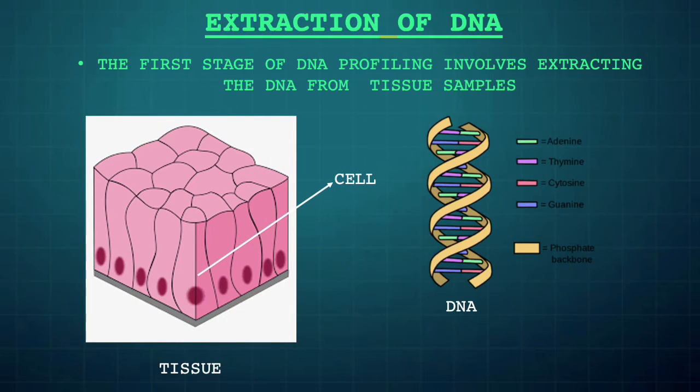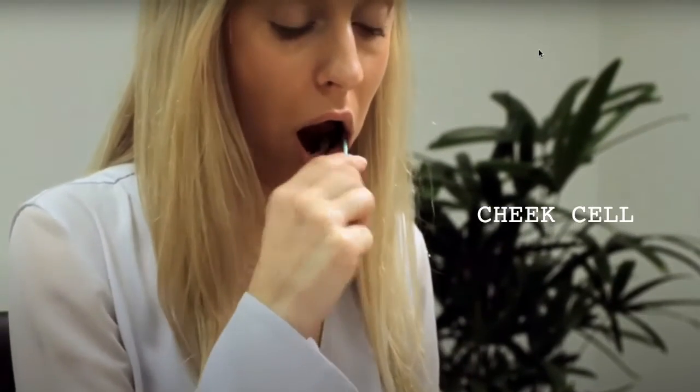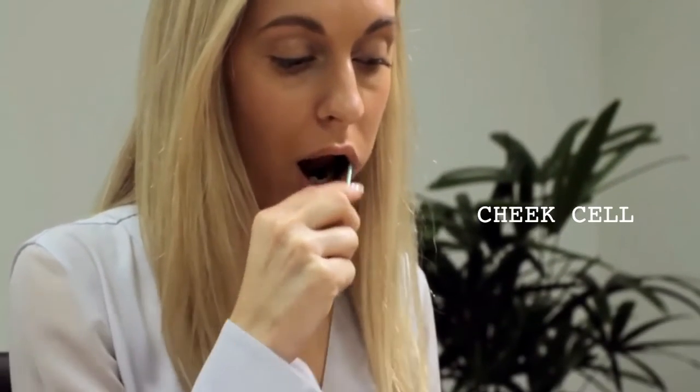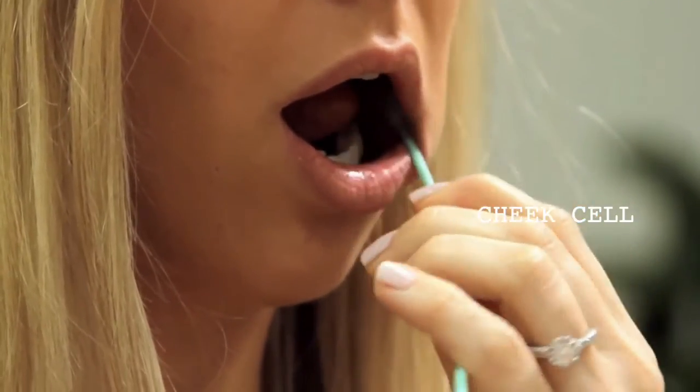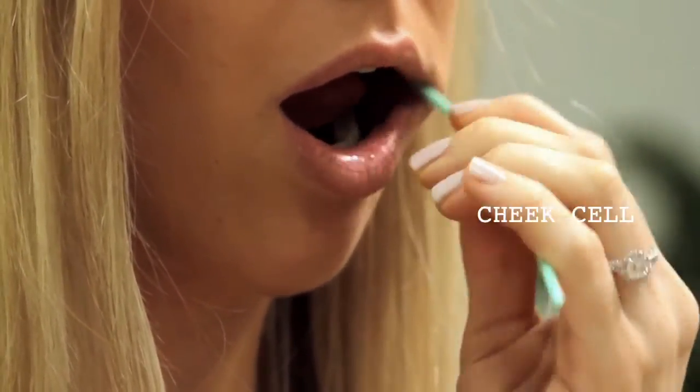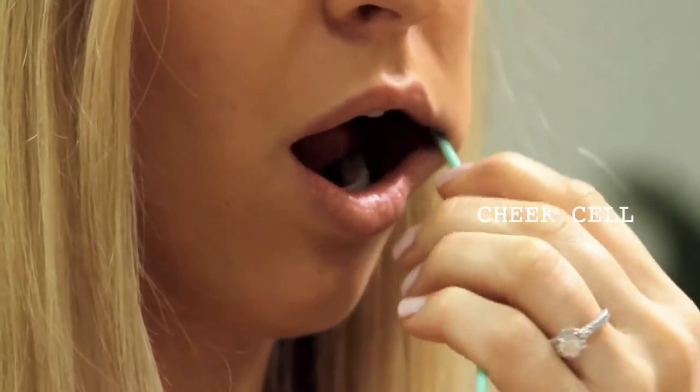Extracting the DNA from the tissue samples of the individuals. From the tissues we have cells, and the cells contain the genome of that individual, so we need to take the genome from one of these cells. The DNA can be obtained in a variety of ways. It can be extracted from cheek cells collected by a mouth swab. The swab has a cotton soft ball on the end, and as it rubs against the cheek, it removes some of the cells, which can then be taken and analyzed.